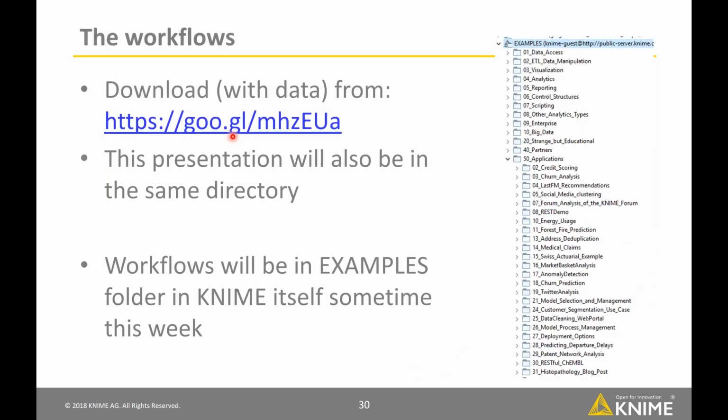Okay, before moving on and doing a brief introduction of the RDKit and looking at some chemistry use cases there, are there questions on what I've shown so far? We have time for that. If anybody has a question, you can either type in the question box and I'll ask it, or I can unmute you if I can find you.